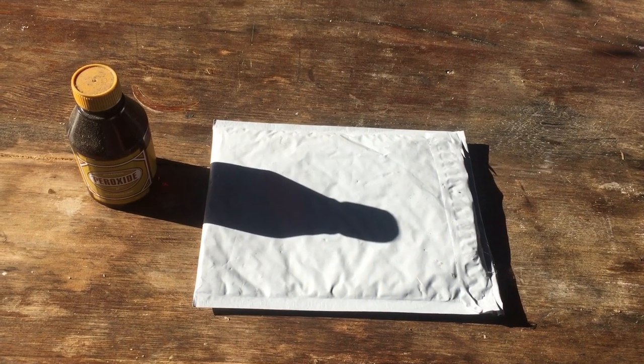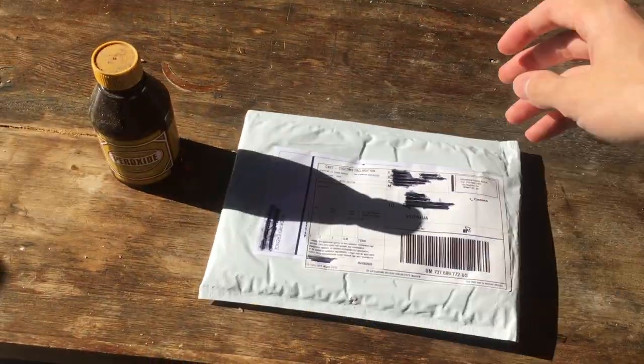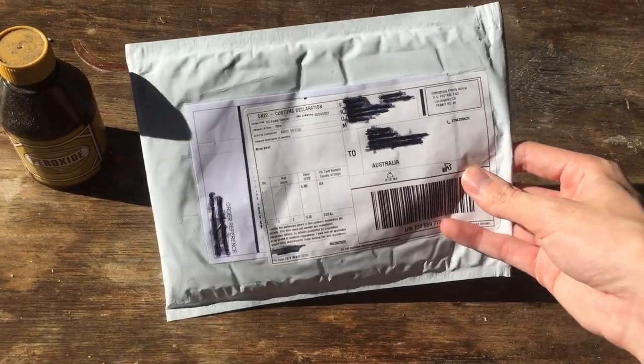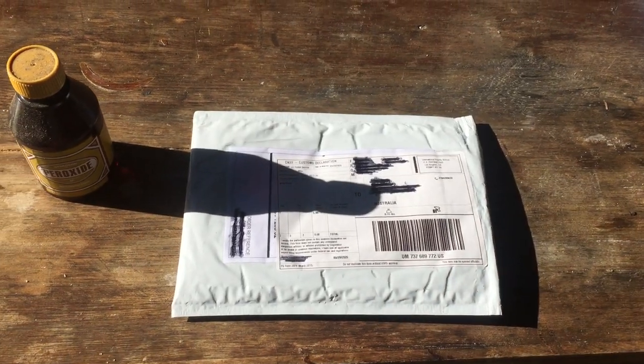I'm making this nice short video today because something came in the mail, and I think I know what it is. You can probably tell from the title of the video. But let's open this up and get it out.